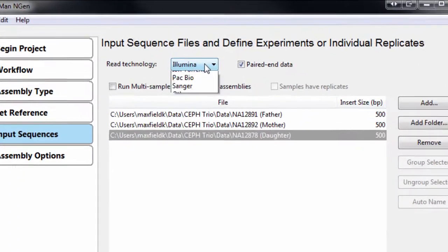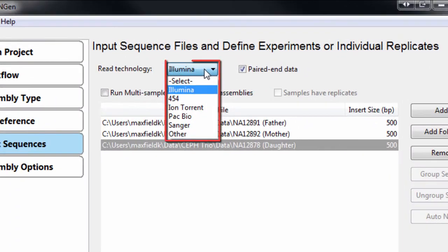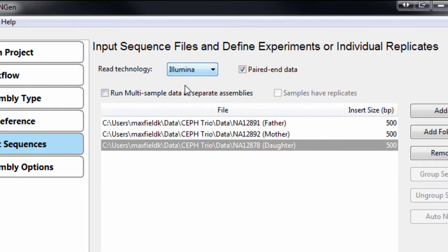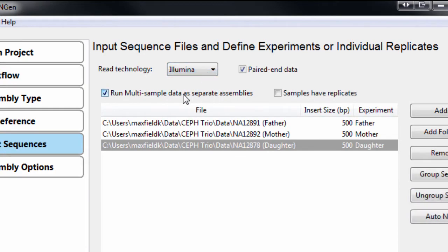The software also supports data from all major next-gen sequencing technologies and can assemble multiple samples from a single project.